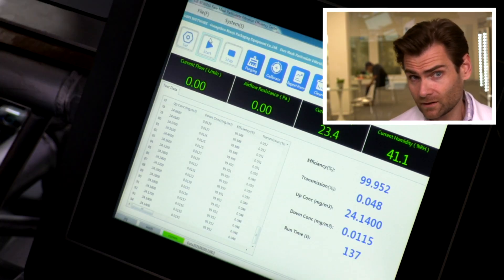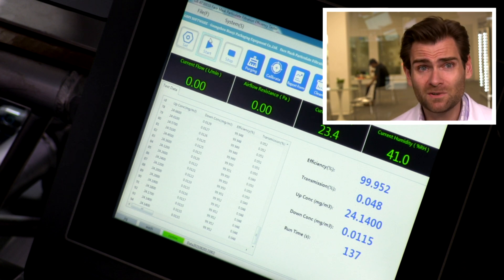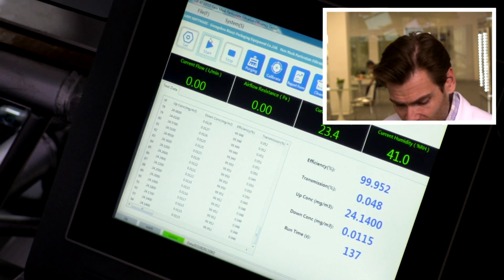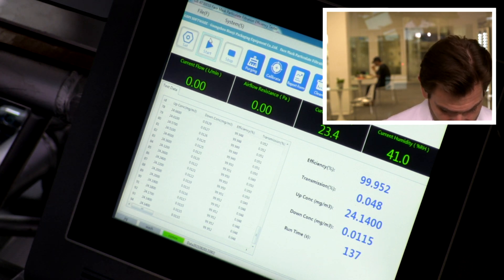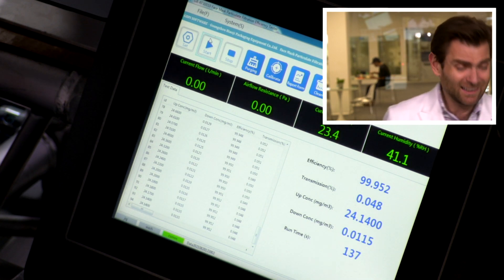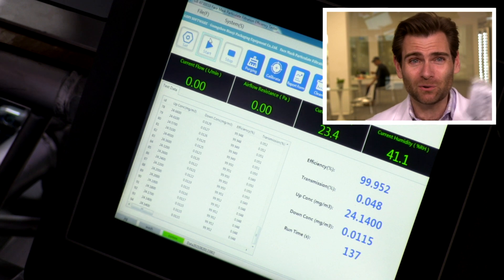But let's look at the PFE. I'm actually surprised it got this low — the efficiency is 99.952%. I would think that an N100 would get a lot higher. Who knows? Could be the storage; I don't know how old this is. But at 99.952%, I mean, it seems like it's a pretty good mask. It does seem like kind of a whole ordeal though. There are plenty of other masks — like the KF94s — that I'd probably recommend instead.